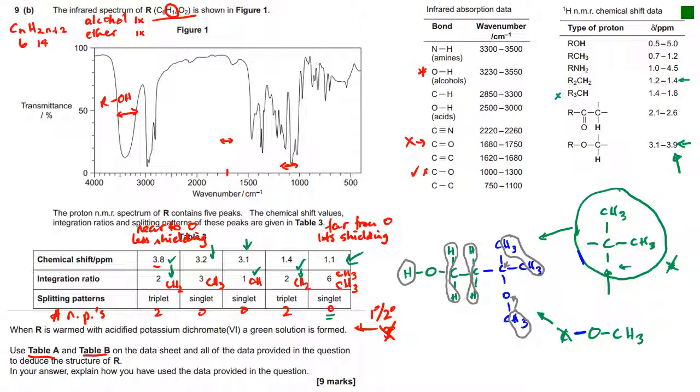And I would just reiterate the last point, that the difficult thing about proton NMR is fitting the molecule together at the end. And that's what freaks people out. But most of the marks are for the preliminary steps. There's only 1 mark for fitting the molecule together correctly. So 8 out of 9 are just going through the standard steps, which I think are less difficult and all of you can do. So good luck.